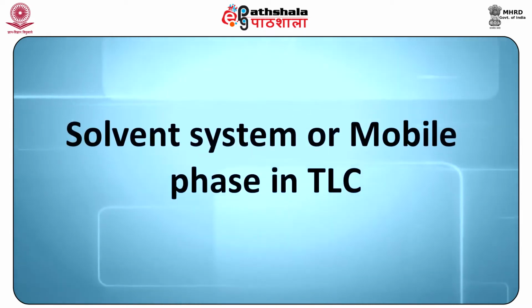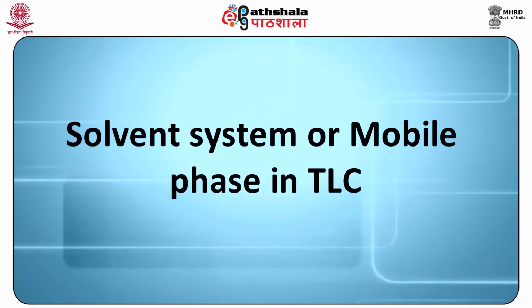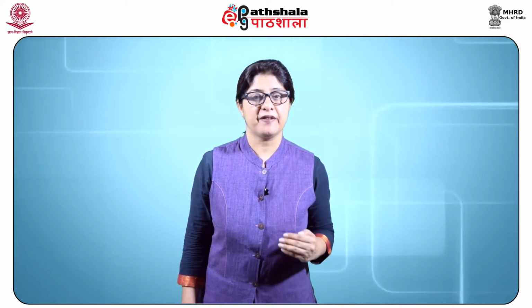Solvent system or mobile phase in TLC. The mobile phase is liquid in thin layer chromatography. The mobile phase is usually a combination of 2 to 5 different solvents selected empirically using trial and error method, guided by prior personal experience and literature reports of similar separations.